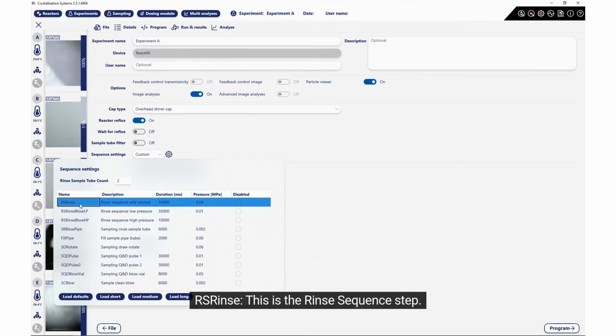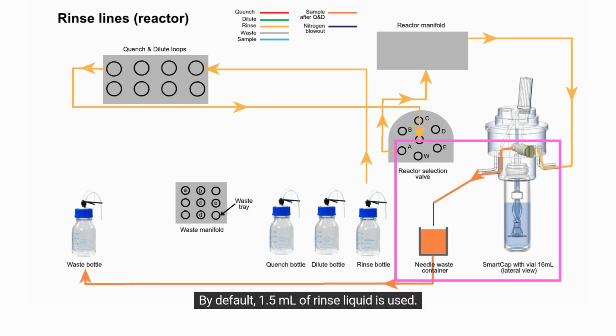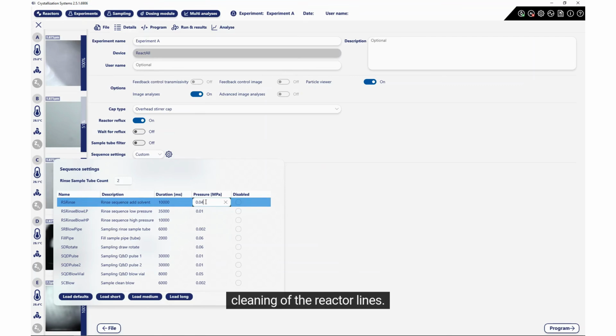RS rinse. This is the rinse sequence step. It flushes rinse solvent through the specific reactor line and corresponding needle to clean the tubes. By default, 1.5 ml of rinse liquid is used. Doubling the rinse duration or pressure will approximately double the volume of rinse solvent, enhancing the cleaning of the reactor lines.